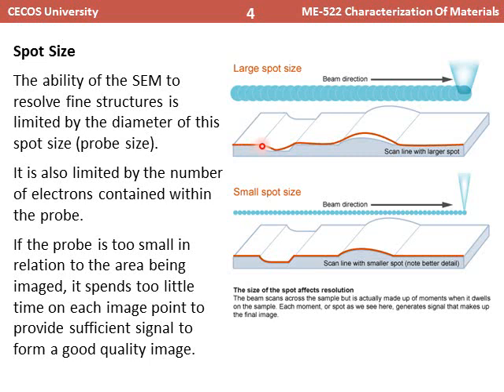By this means the corners or the fine structures are passed by, meaning the fine structures cannot be differentiated in the case of a large spot size. As you can see, with a large spot size the sharp curvatures are missed. You are just seeing the surface morphology on a rough scale.